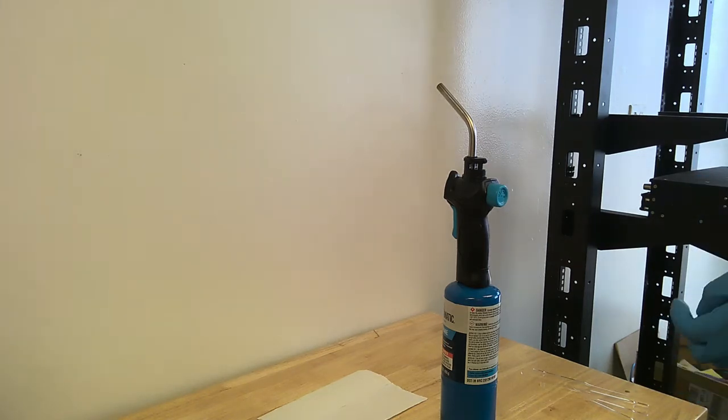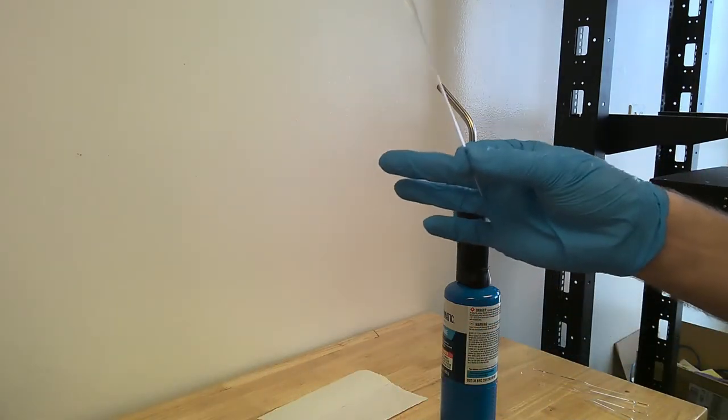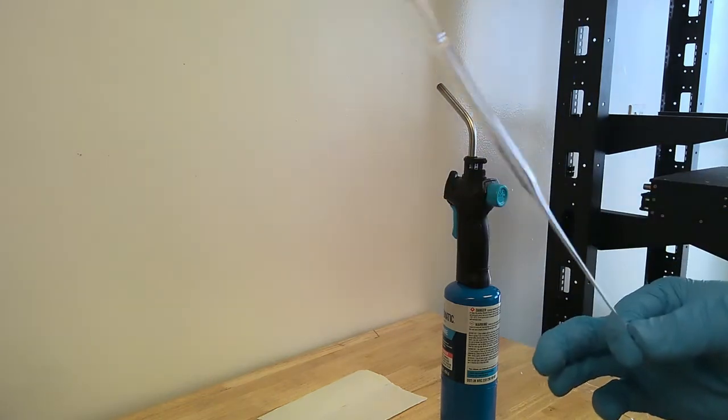I'm Professor Martinez, and today we'll be discussing organic glassware and how to prepare common pieces of organic glassware from commercially available 7-inch pipettes and a burner.